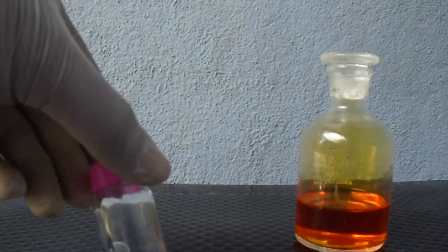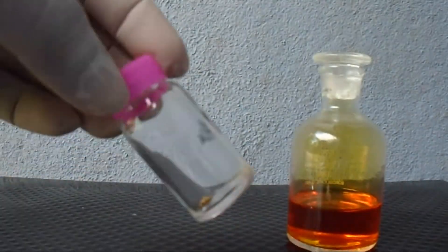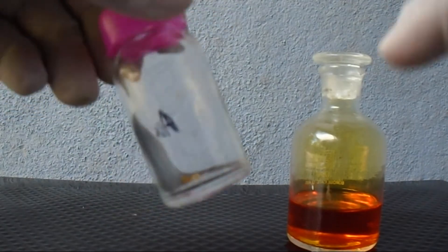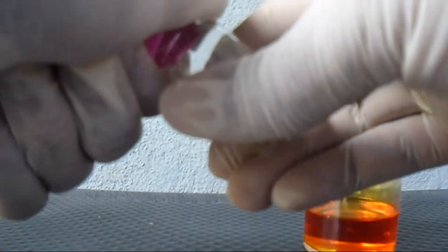Remember, gold is a very unreactive metal — it doesn't react with any strong acid. But aqua regia is the solution that can dissolve this gold.